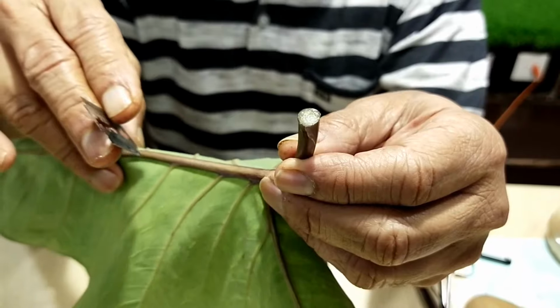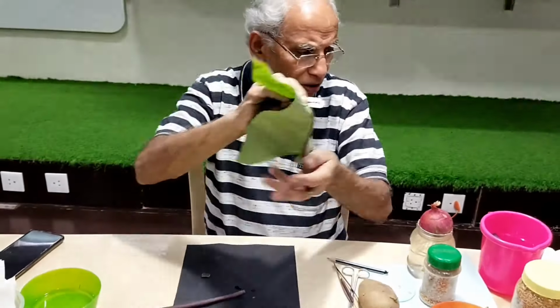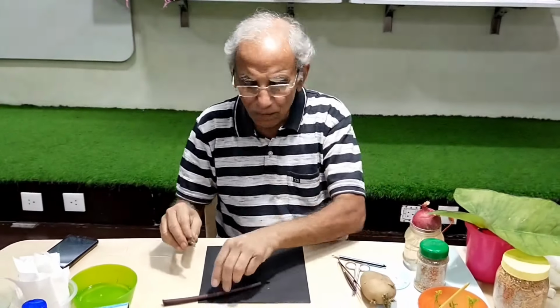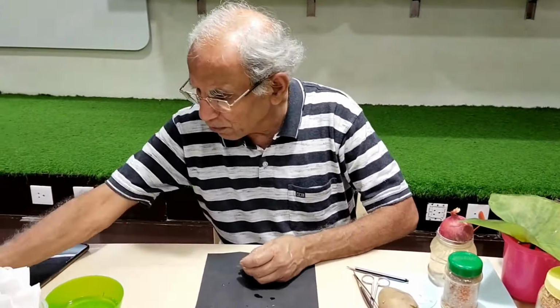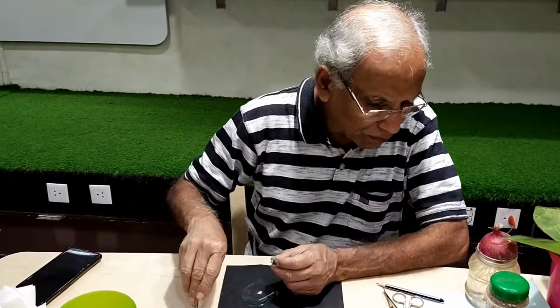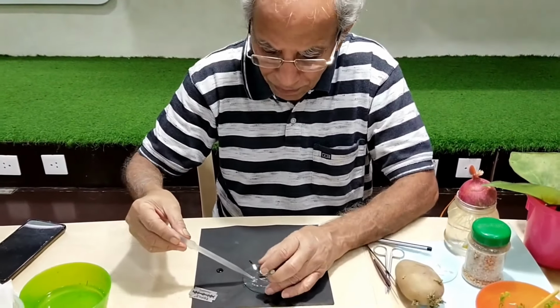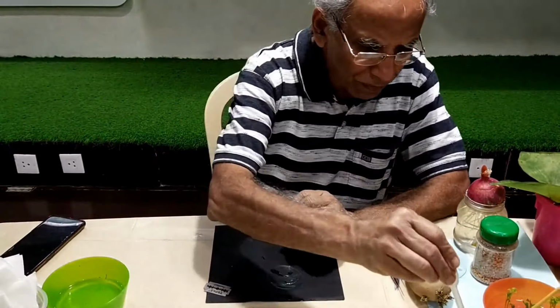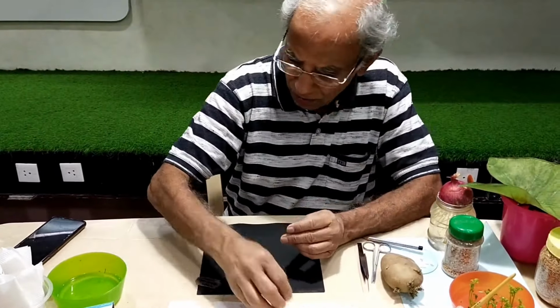So let's now go for observation of the things, but I have to take sections. So I'll just put it back here, and now I'll take a few sections in the watch glass as usual. Usually you take a few drops of water. And yes, that should be enough.